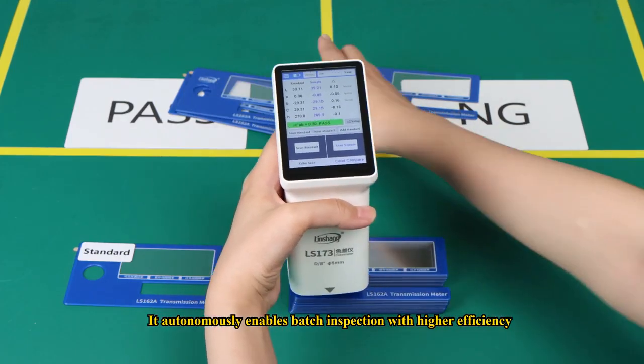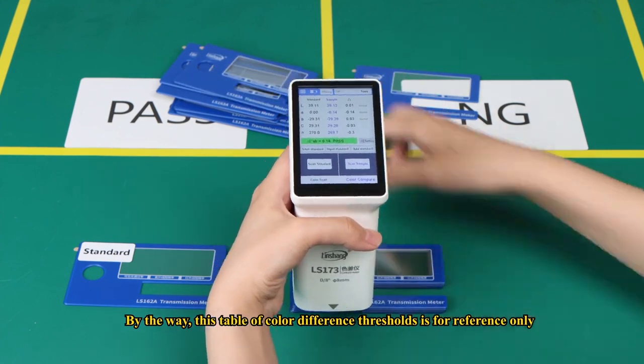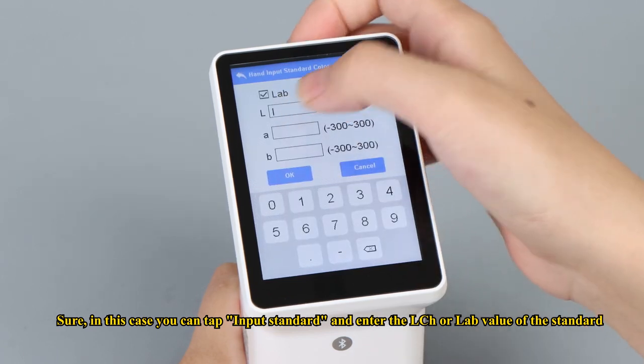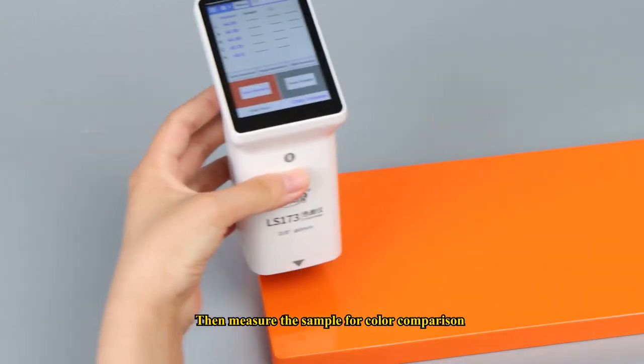It autonomously enables batch inspection with higher efficiency. Note that the table of color difference thresholds is for reference only. If the standard material is not at hand, you can tap input standard and enter the L, C, H or L, A, B values of the standard, then measure the sample for color comparison.